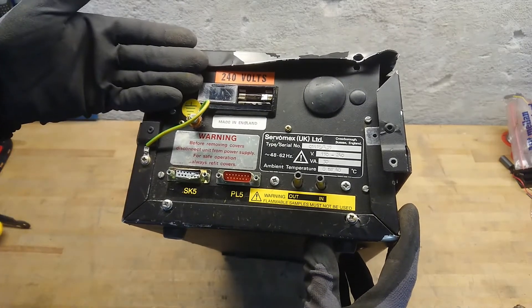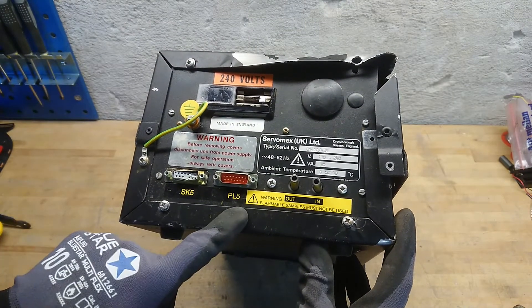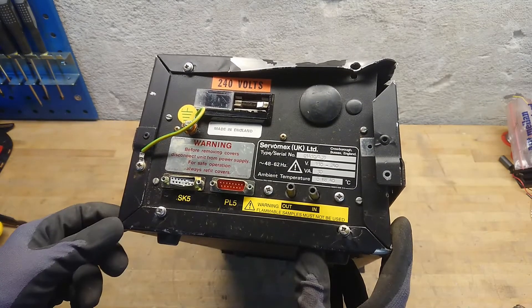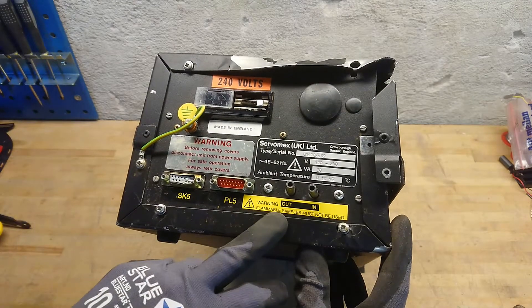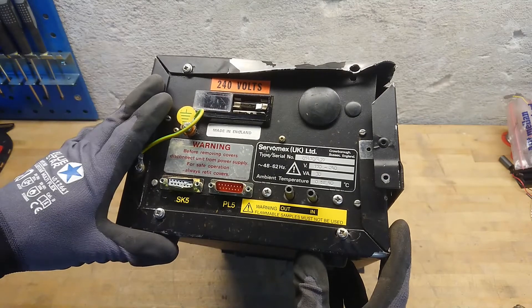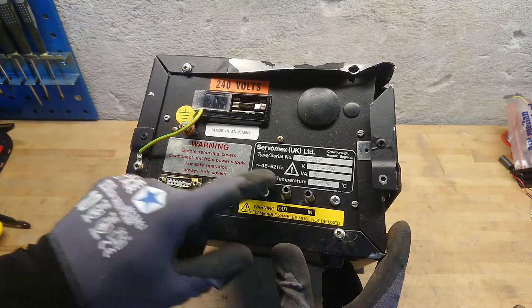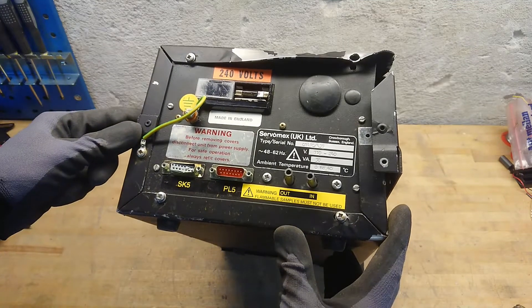Here at the back, we can see it's a 240-volt unit made in England. It has SK5 and PL5 connections, probably because this can sit in a chain of an analyzer series of apparatuses. We can see it says flammable samples must not be used, so this clearly is not an EX-rated device. It can take 110 to 240 volt AC at 48 to 62 hertz, so it is an internationalized unit.